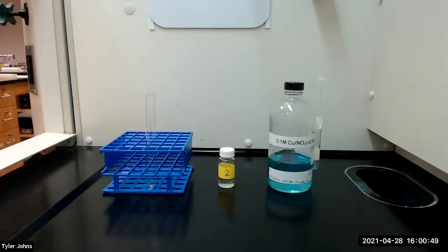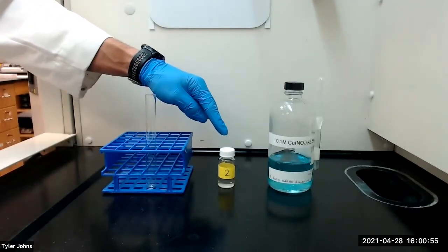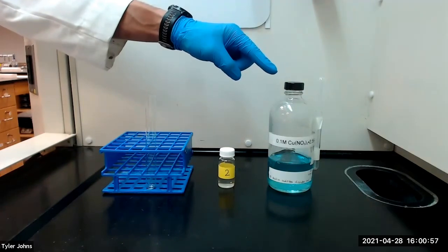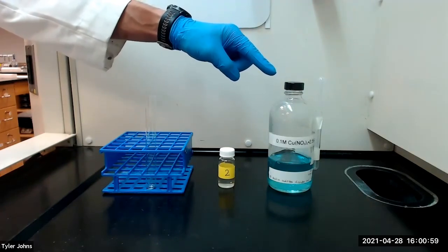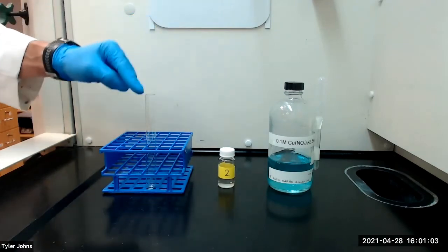We will next test the relative stability of an unknown species. We have been given unknown number two. We will begin by adding one milliliter of 0.1 molar copper II nitrate solution and one milliliter of unknown number two to a test tube.